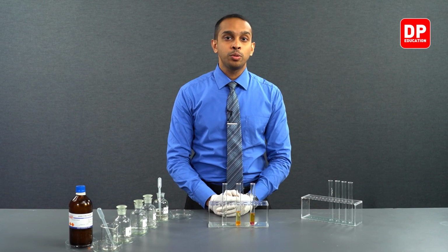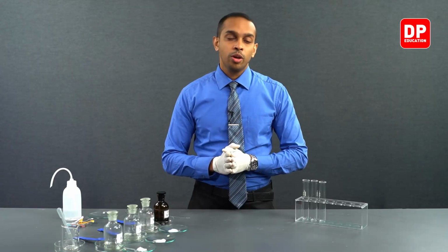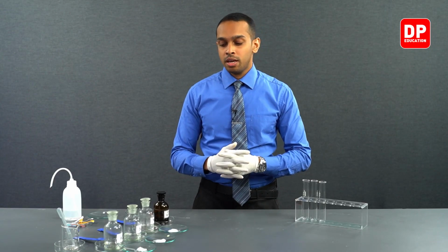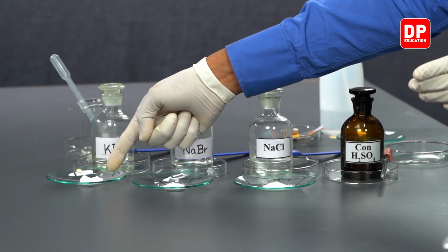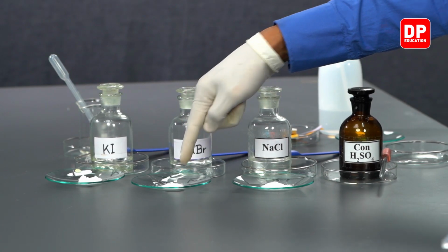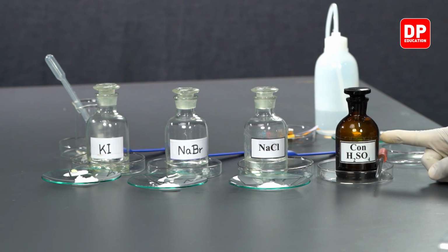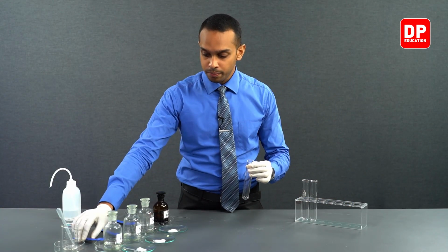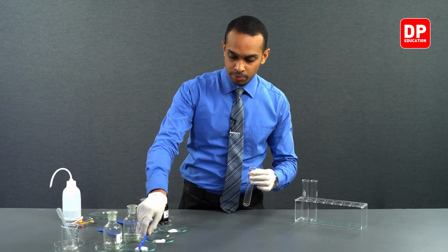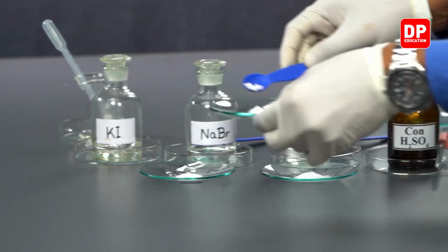Let's move on to the test with concentrated sulfuric acid. Finally, we are moving on to the reactions that will take place when we react potassium iodide solid, sodium bromide solid, and sodium chloride solid with concentrated sulfuric acid. So first we'll take potassium iodide solid. A little bit of potassium iodide we'll take into a small boiling tube.